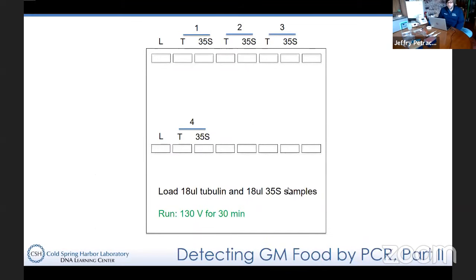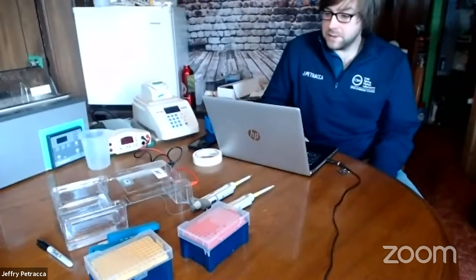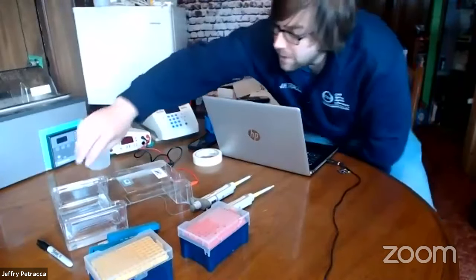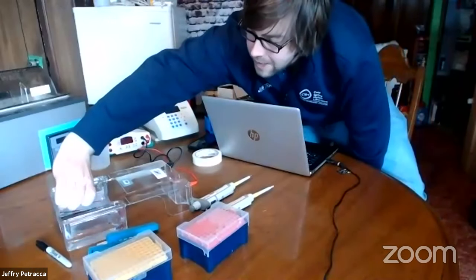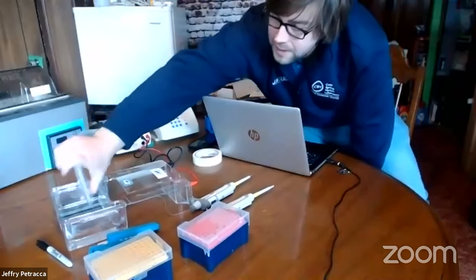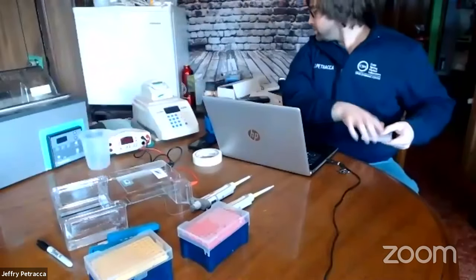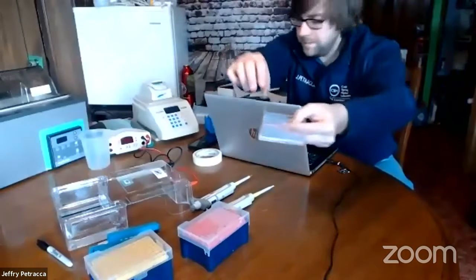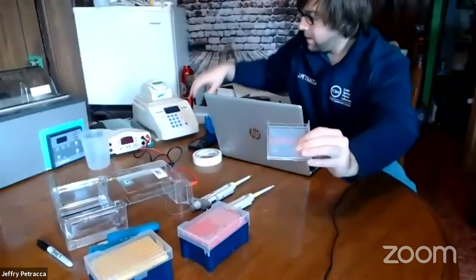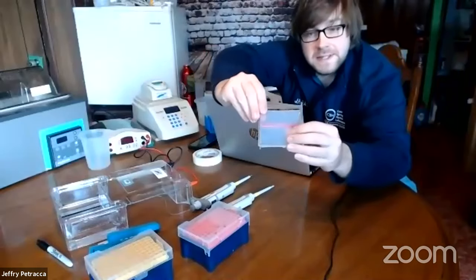What we did yesterday, as a reminder, is we amplified our DNA through the process of PCR — that took about an hour and a half. Today, we're going to take a look at those PCR products through gel electrophoresis. Before you guys got here, I went ahead and made up a gel for us — a 2% agarose gel.